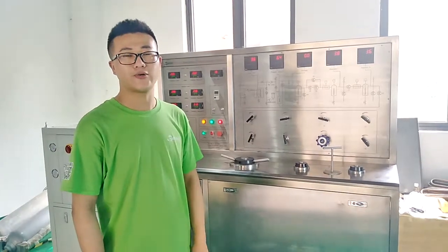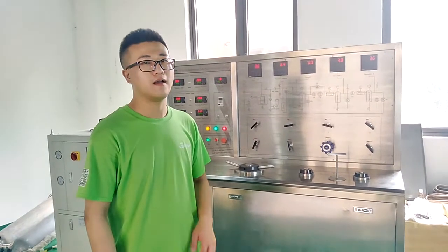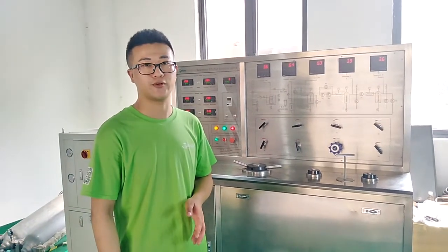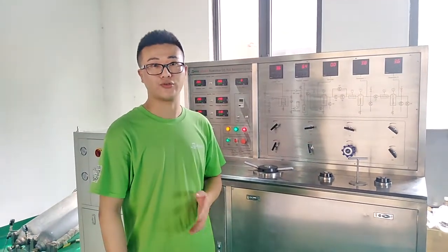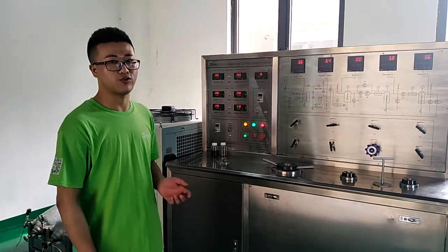Hello, this is Rich Liu. I work for Sunfire Biter Industry Company. Today it's my honor to introduce one of our products to you. It's a CO2 extraction machine.